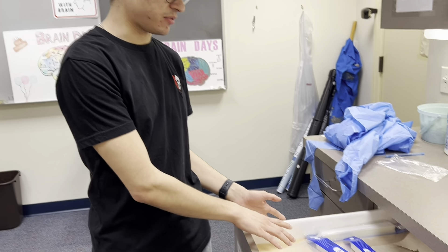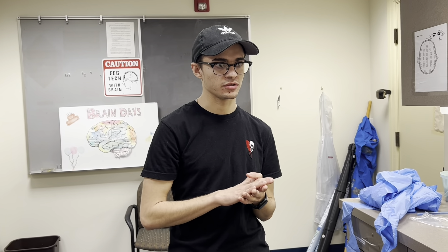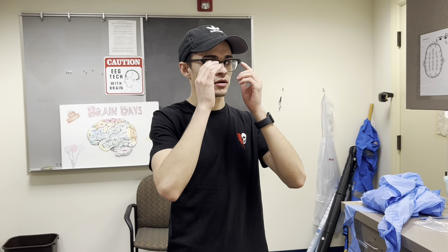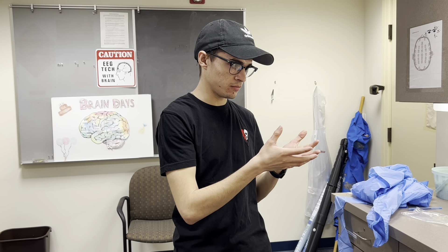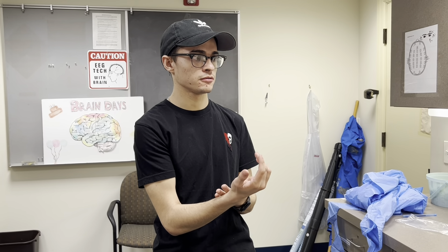If you do use a face shield, do the same thing as you would with masks: put your name or initials on the face shield and put it up in this drawer. Jewelry is another thing to discuss. If you have any soft material jewelry, such as a gold ring or bracelets, you might want to take those off. With the saline gel you're working with, it could get on your bracelets and soak in. If you're working with enviroside, that would be pretty bad because you don't want that on your skin. Taking off your bracelets or leaving them at home alleviates that worry.